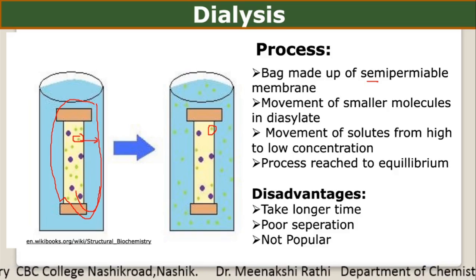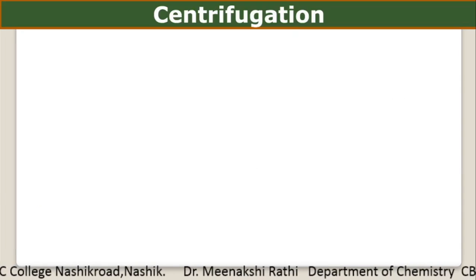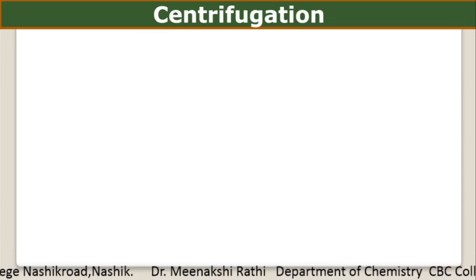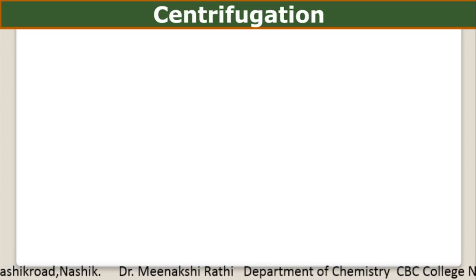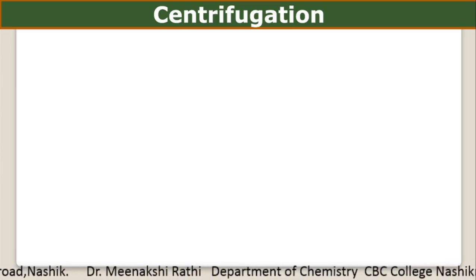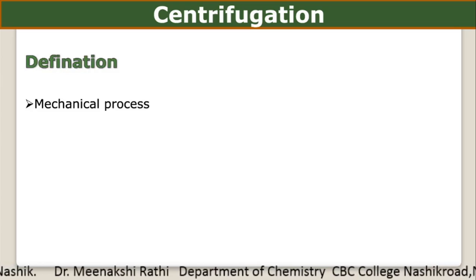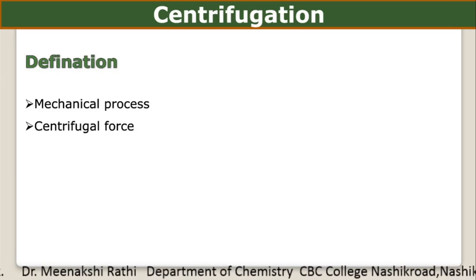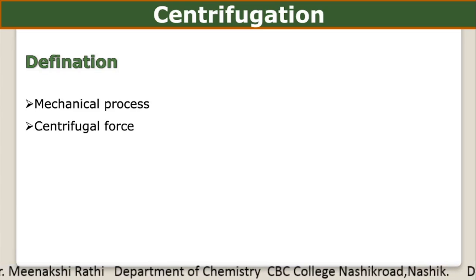That's why it is not a very popular technique. Another technique is centrifugation. This method is also based on the size of the biomolecule. Now in the centrifugation process, first we'll see the definition of centrifugation, that it is a completely mechanical process, and here to separate the molecules, centrifugal force is used.